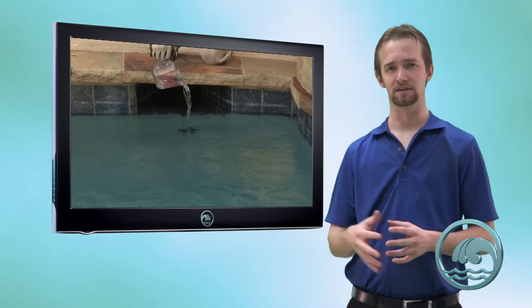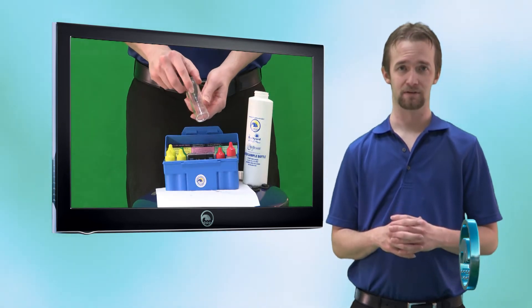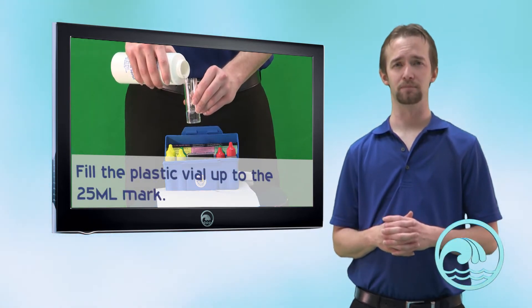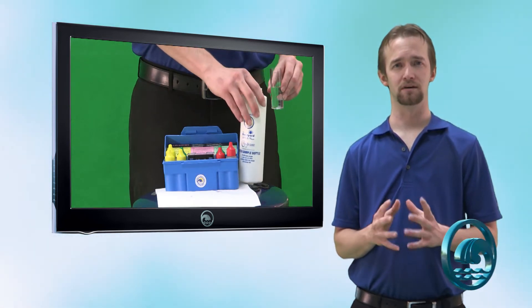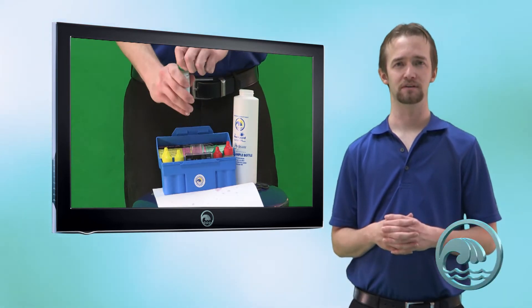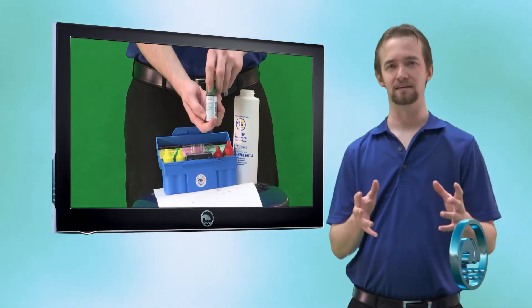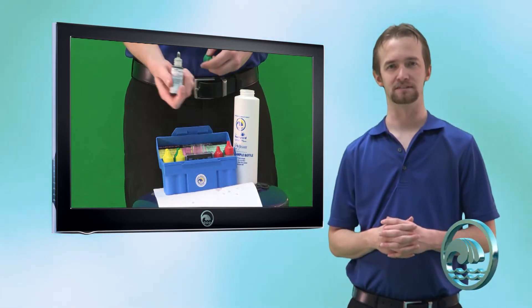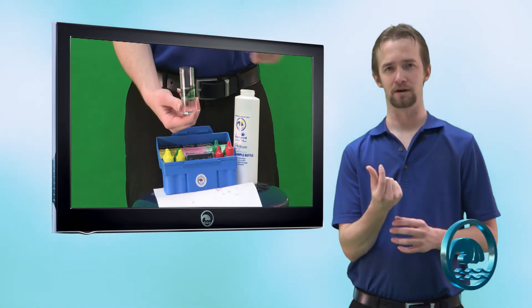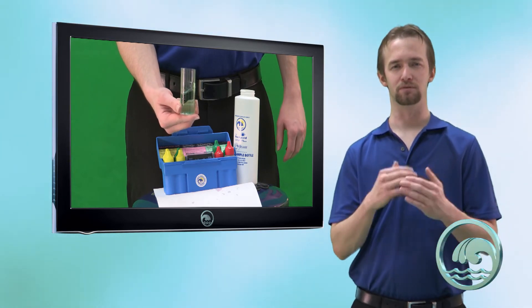Now that we've tested our pH, we need to move on to alkalinity, which is the last thing we can test for using the K1004 test kit. To test for alkalinity, take out the round plastic compartment, fill it with pool water up to the 25 milliliter mark. Alkalinity is the green test — the green bottles. Take the first green bottle, R0007, the thiosulfate, and do two drops into that water sample. Now take the next bottle, R0008, the alkalinity indicator, and do five drops. Instead of shaking it up, use a process called swirling — grab the compartment by the bottom and start to swirl, so the green liquid becomes uniform throughout the entire water sample.